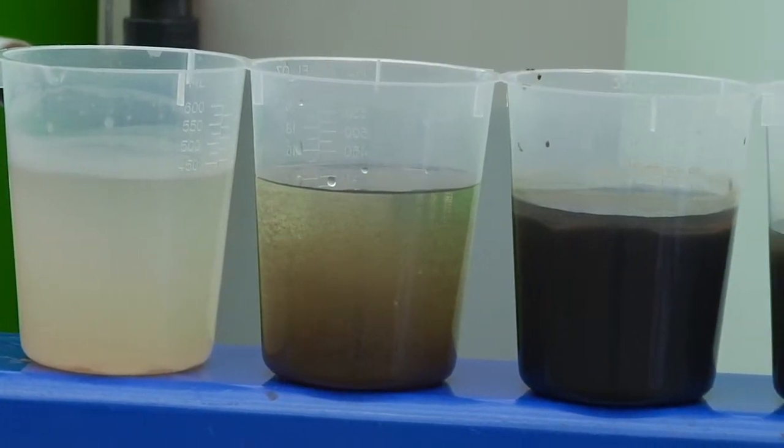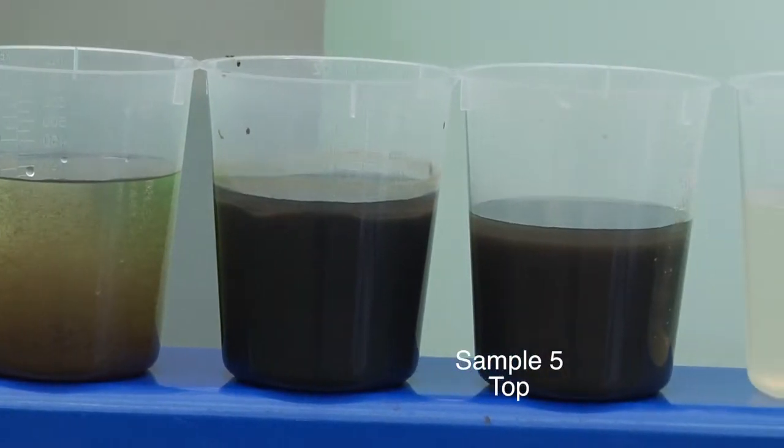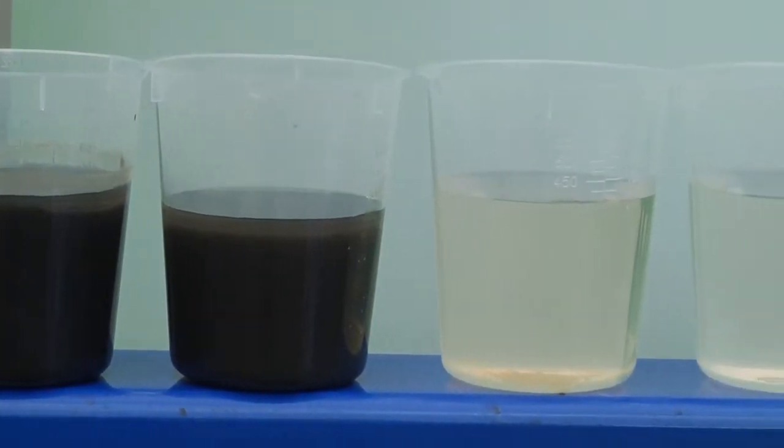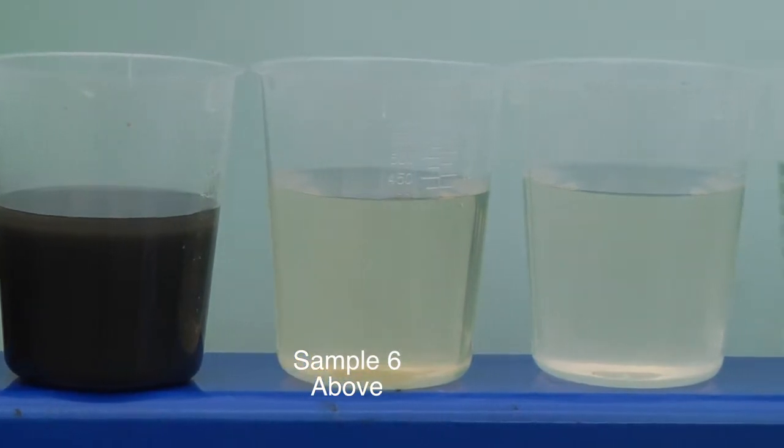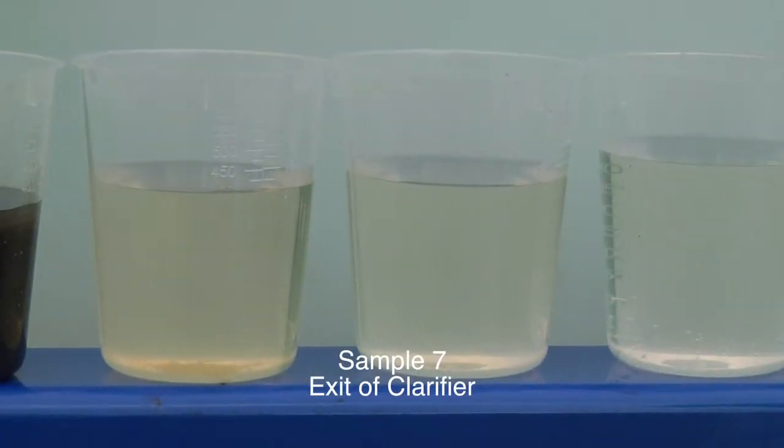Number four is the bottom of the sludge bed. Number five is the top of the sludge bed. Number six is immediately above the sludge bed. Number seven is the exit of the clarifier.